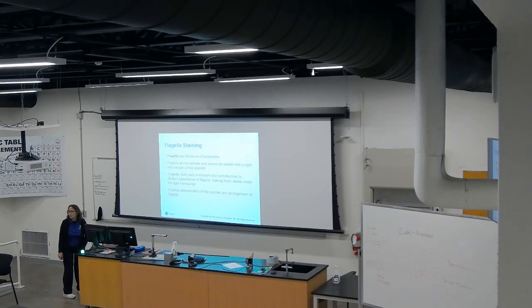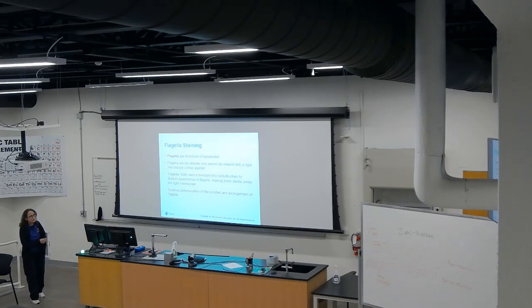Now for flagella. Flagella are long extensions that not all bacteria have, but if a bacterium has them, the flagella are able to produce locomotion or movement. Because flagella are very thin, they cannot be seen with regular microscopy, so you have to add coats of a mordant.